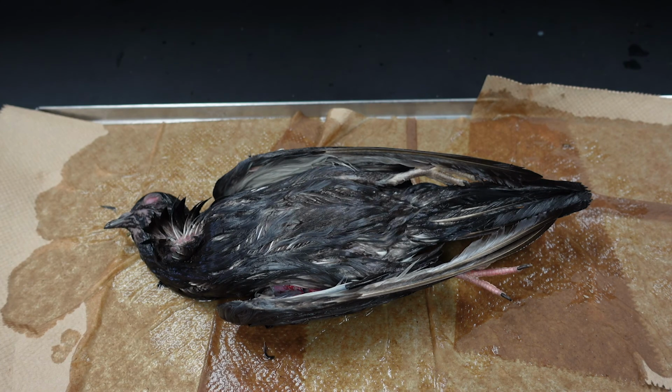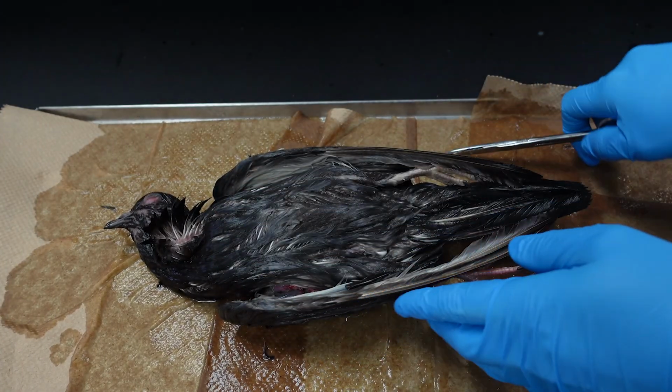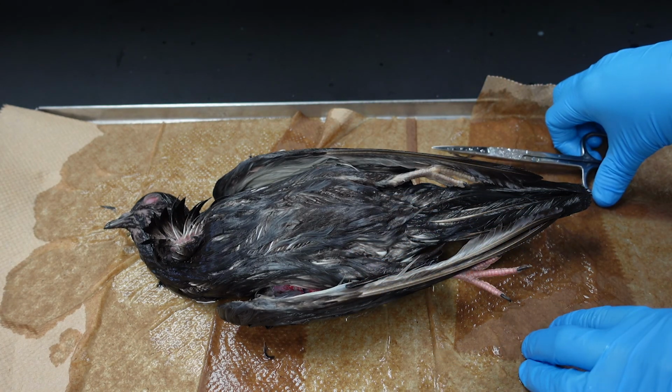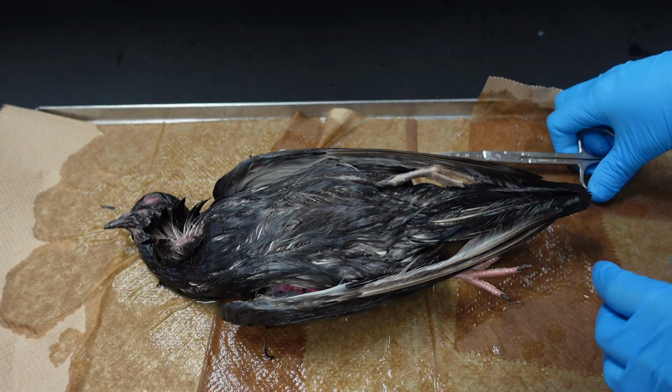Hey everyone, we'll be dissecting the pigeon today, and the first thing that you want to do when you're dissecting is remove all of the skin and feathers, because the feathers can retain a lot of this preservative fluid, so they can be a little bit smelly. And we want to just be looking at the muscles and not have feathers getting in the way.